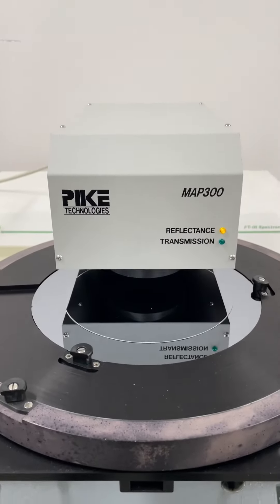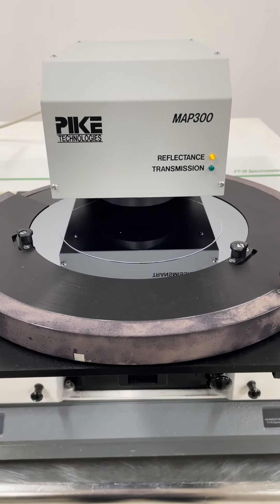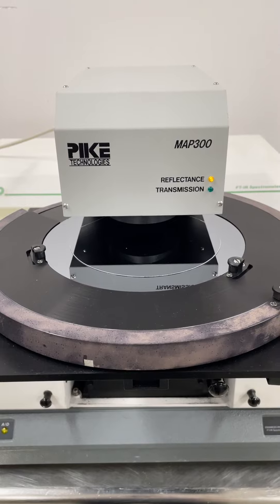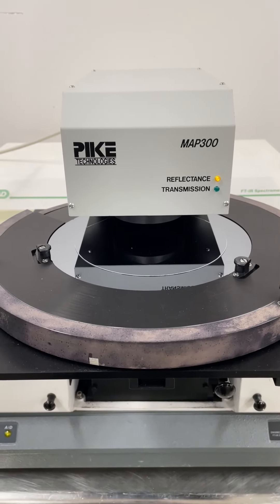It's looking at point 8 right now. This is the 9th test point. After this, it's going to cycle to the outer ring.